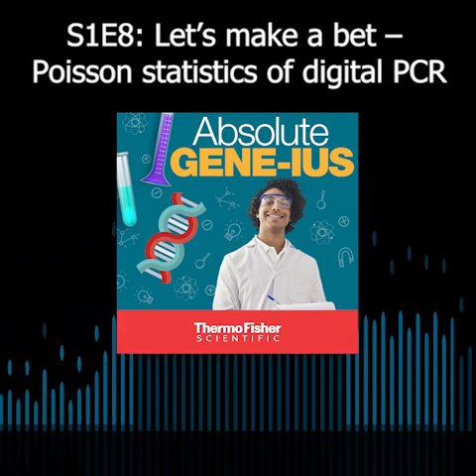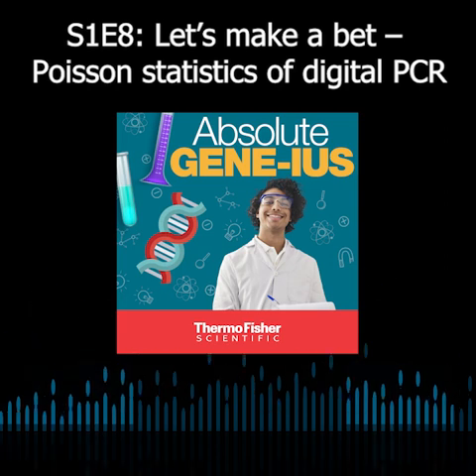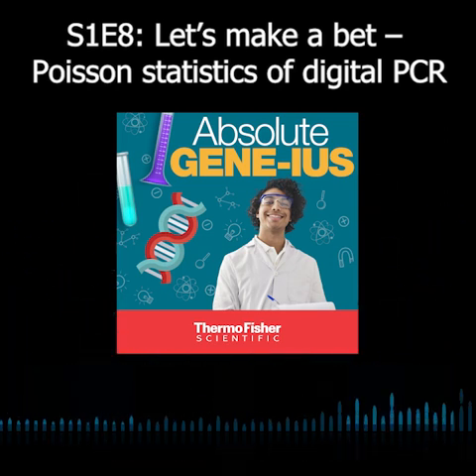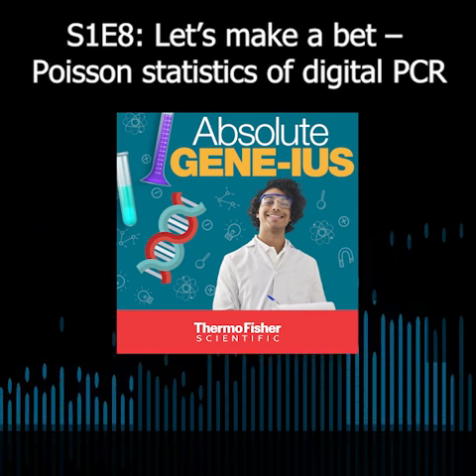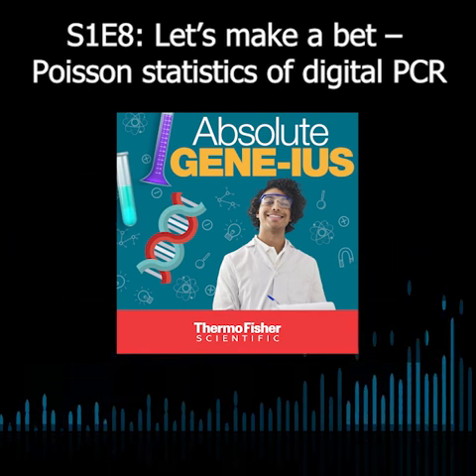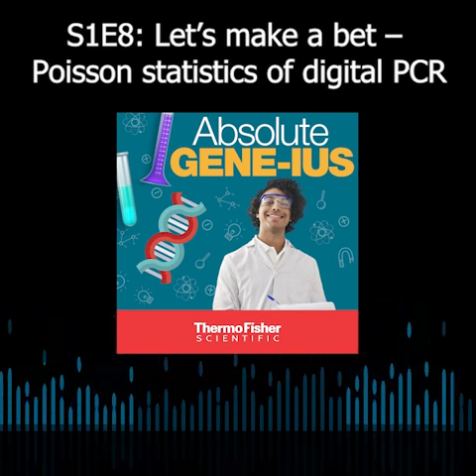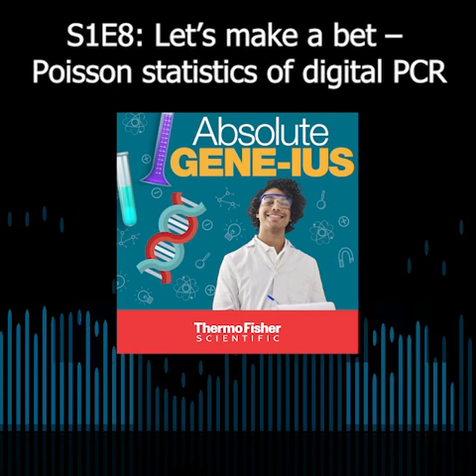And the other value it adds is multiplexing. Because a lot of times with real-time PCR, if you're multiplexing, you might compromise the efficiency of the different primer and probe assays in there as you mix more and more together. So it's hard to make a 4-plex quantitative assay with real-time PCR. But with digital PCR, it's so much easier to have multiplex assays, multiple targets with different color dyes, all in the same reaction, because we don't care about that efficiency.